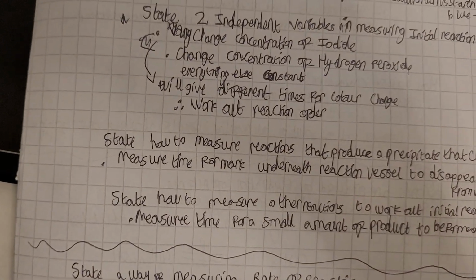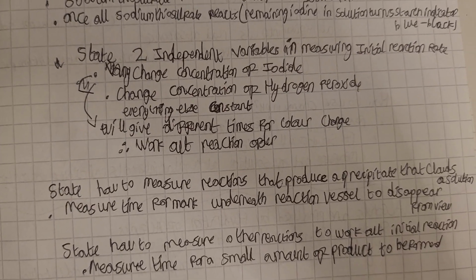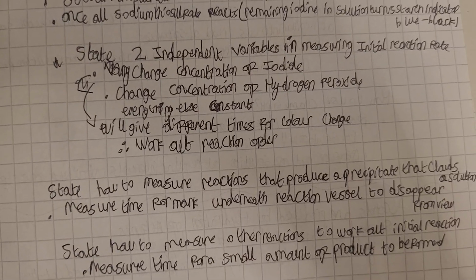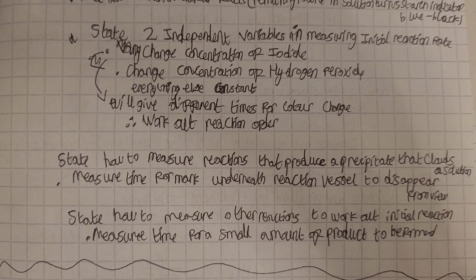State how to measure reactions that produce a precipitate that clouds a solution. You just need to measure the time for the mark underneath the reaction vessel to disappear from view.